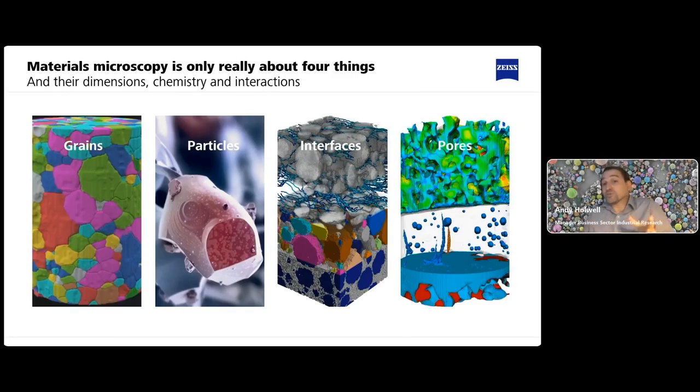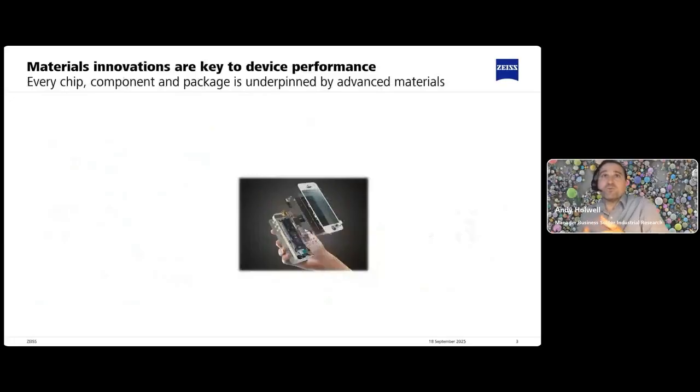And then when we talk about all of those solid domains, you also, of course, have to talk about the pore domain and the voids and spaces within your materials. And they may be intended or they may be unwanted, such as porosity in ceramics or castings, that sort of thing. So really, grains and crystals, particles and inclusions, surfaces and interfaces, and the empty spaces too. And materials innovations really are the key to the performance of those devices.